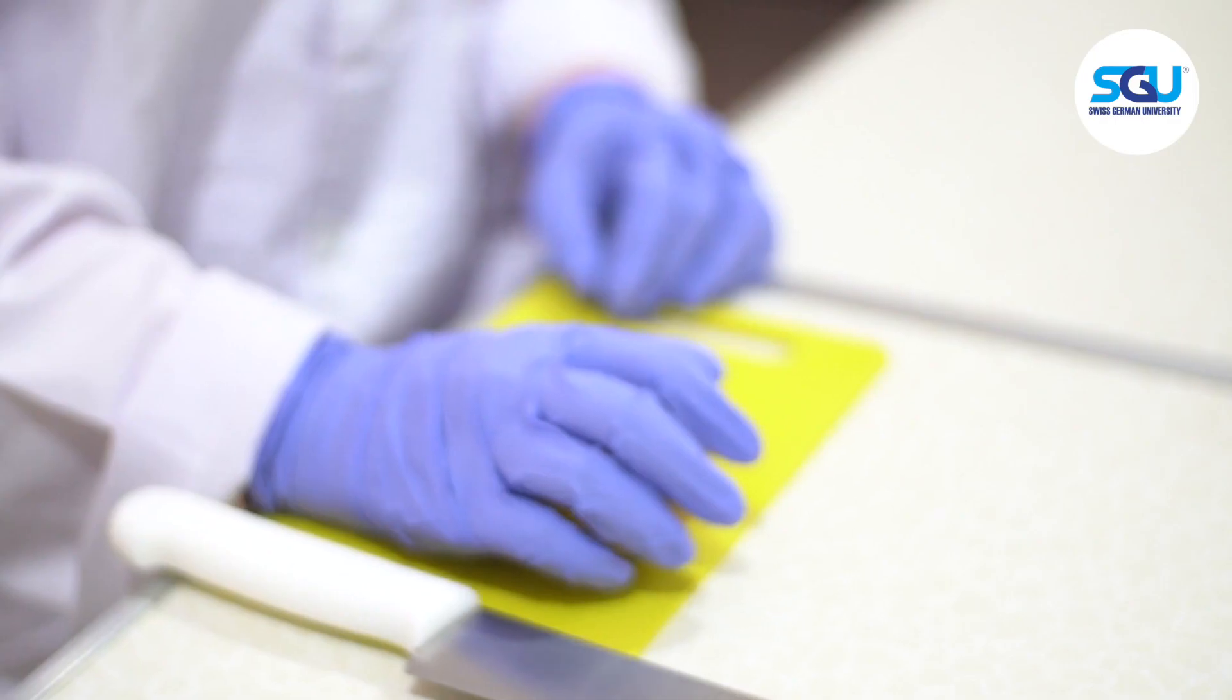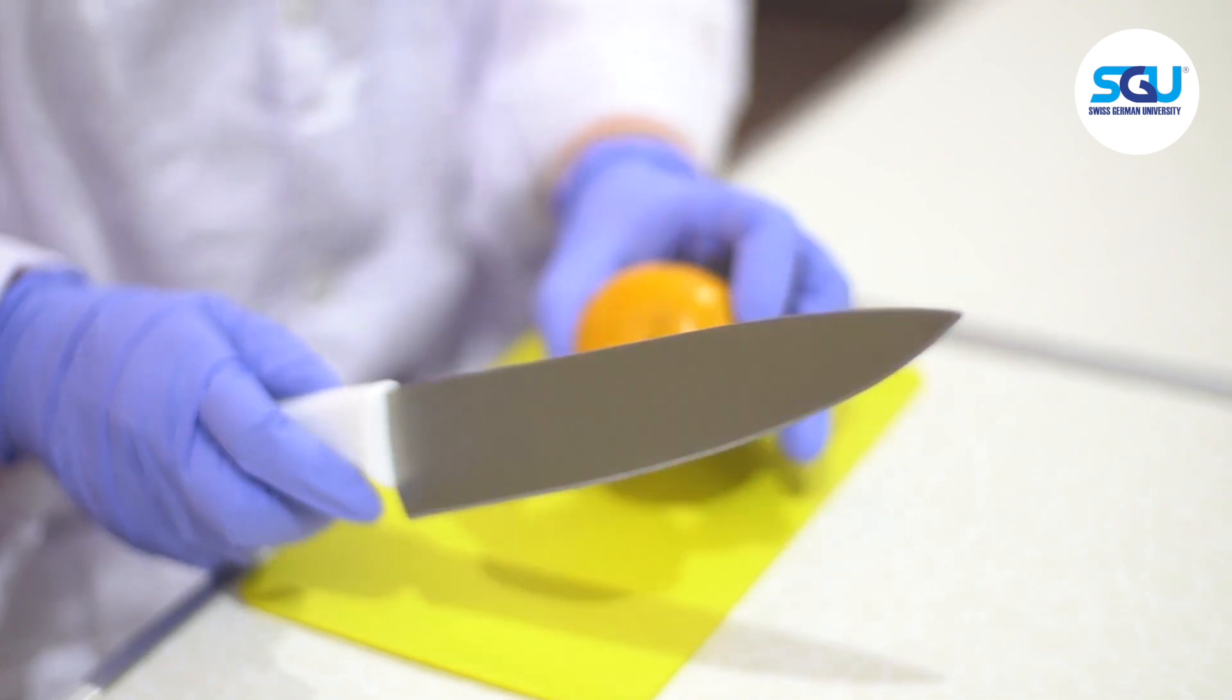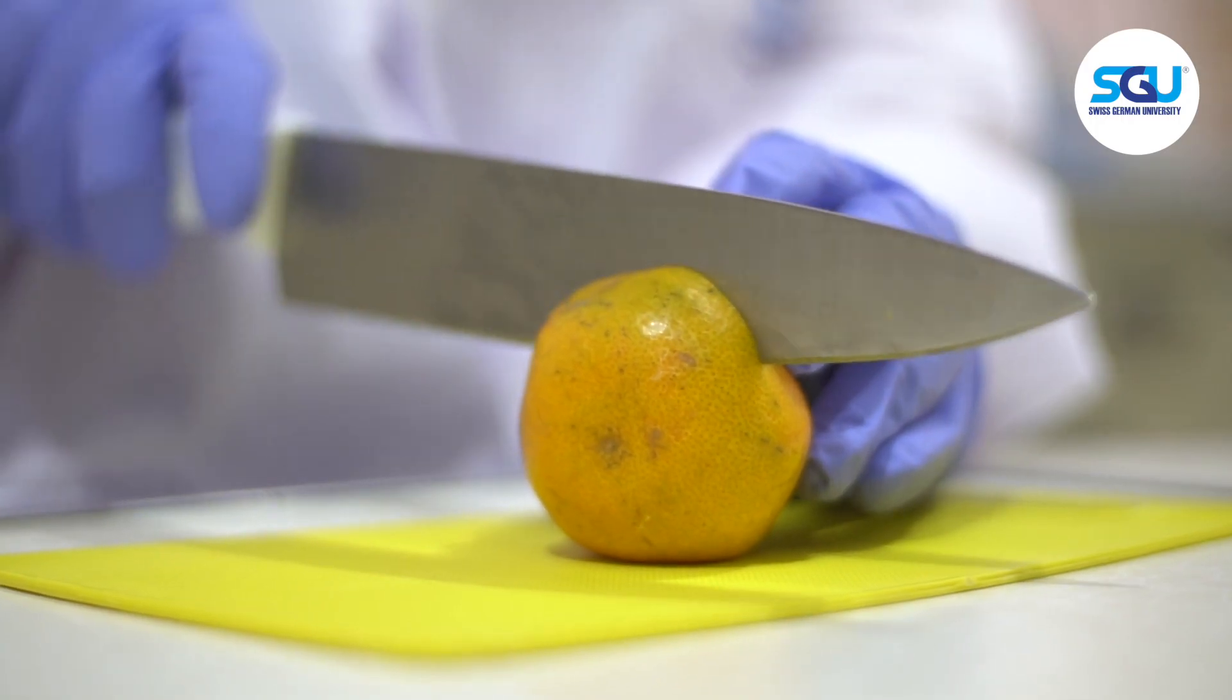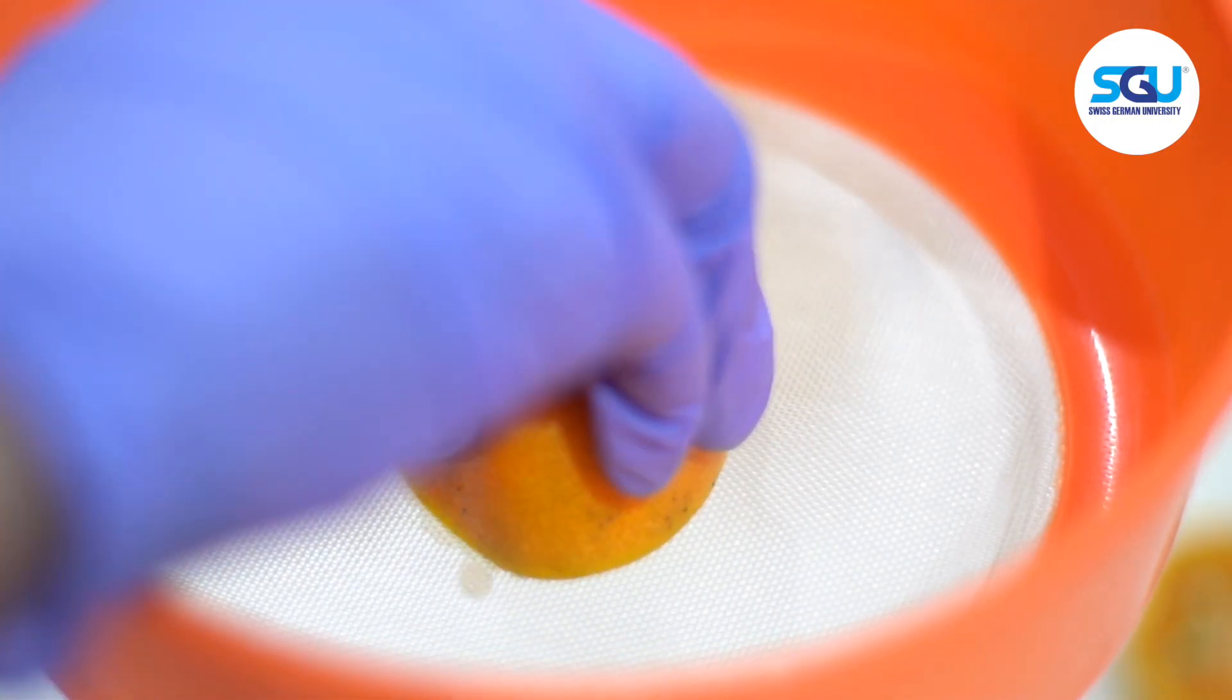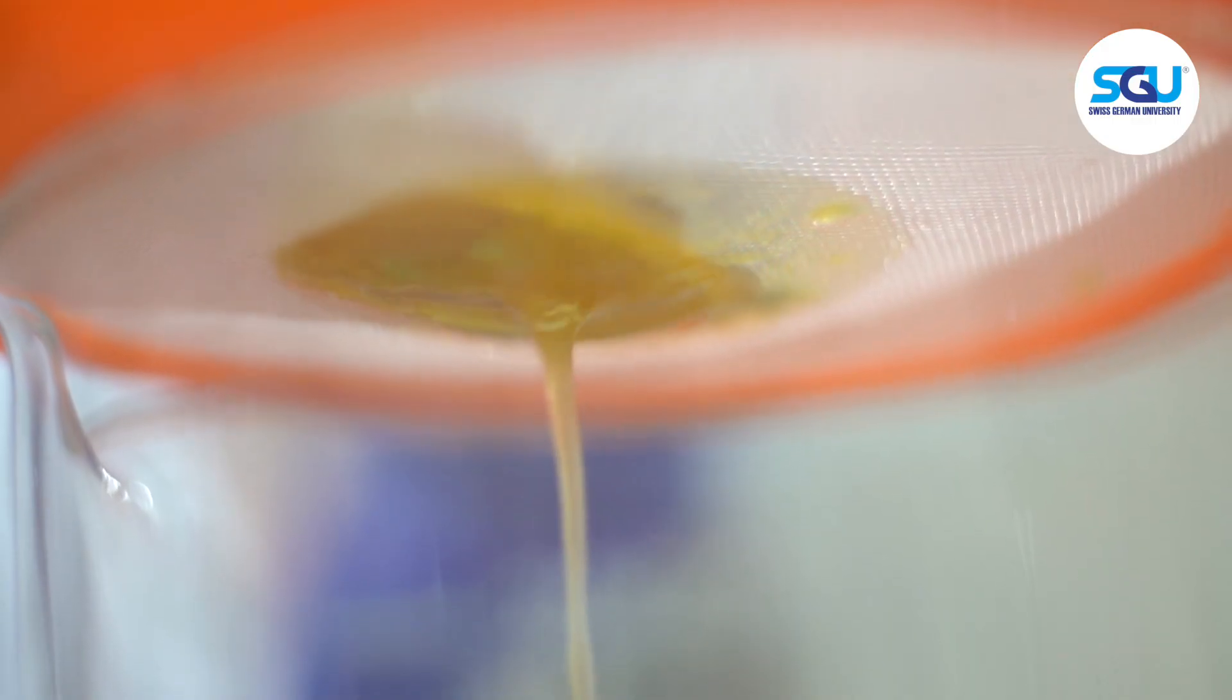To start the experiment, the orange fruit is prepared. After cutting the orange, the juice was extracted by squeezing an orange into a filter to separate the juice from its pulp.